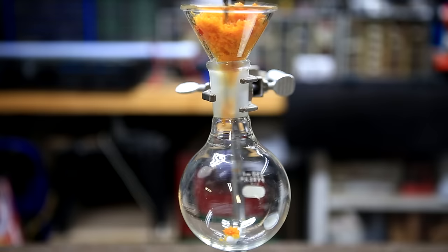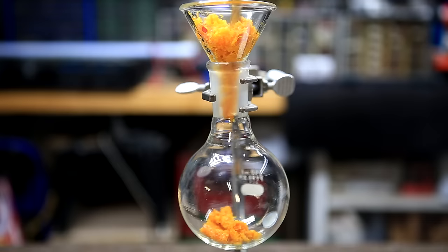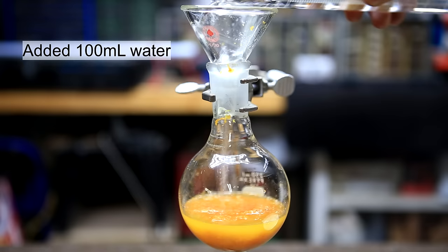The orange peels can then be transferred to a round bottom flask. To this was added a hundred milliliters of water. The water also helped to rinse off orange peel that remains stuck to the funnel.